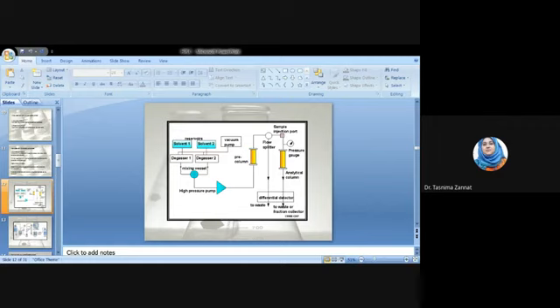In this analytical column, there are a lot of plates, which are coated with an adsorbent like silica gel or alumina. When the mobile phase goes through these plates with the sample, a lot of physical or chemical interactions can happen with the plate.